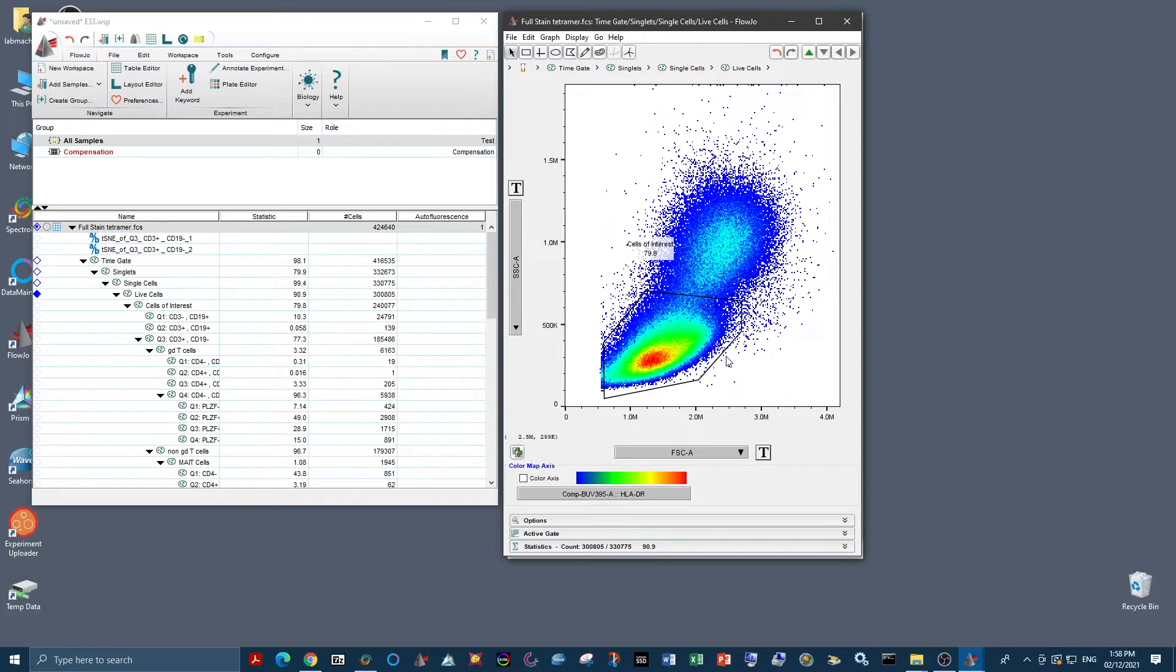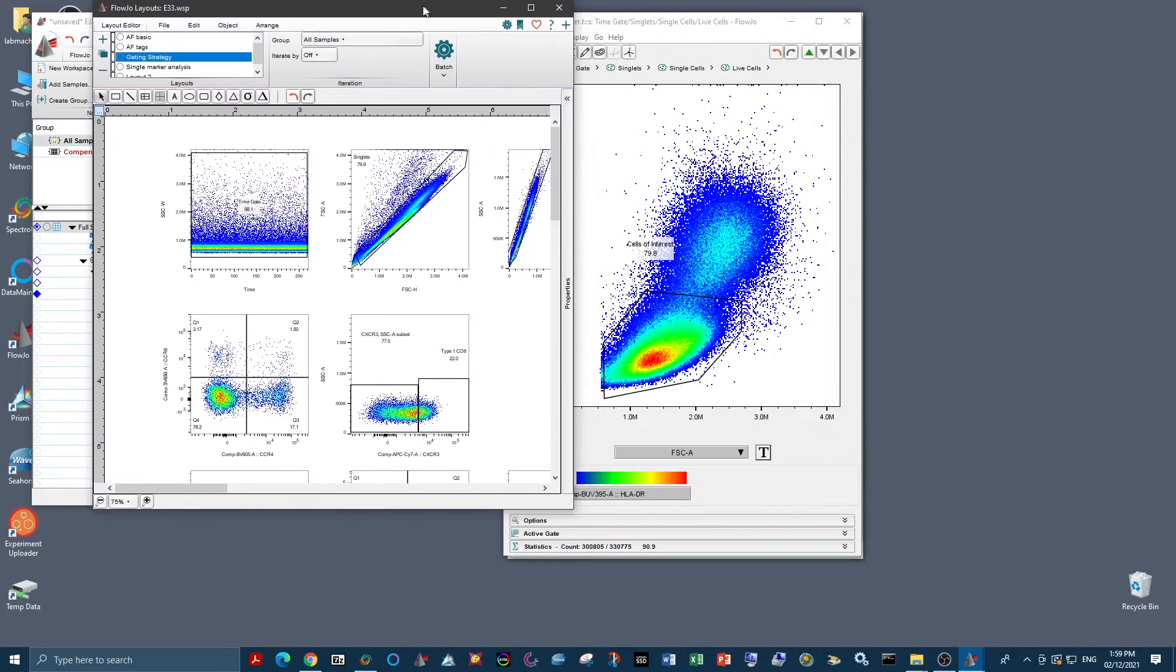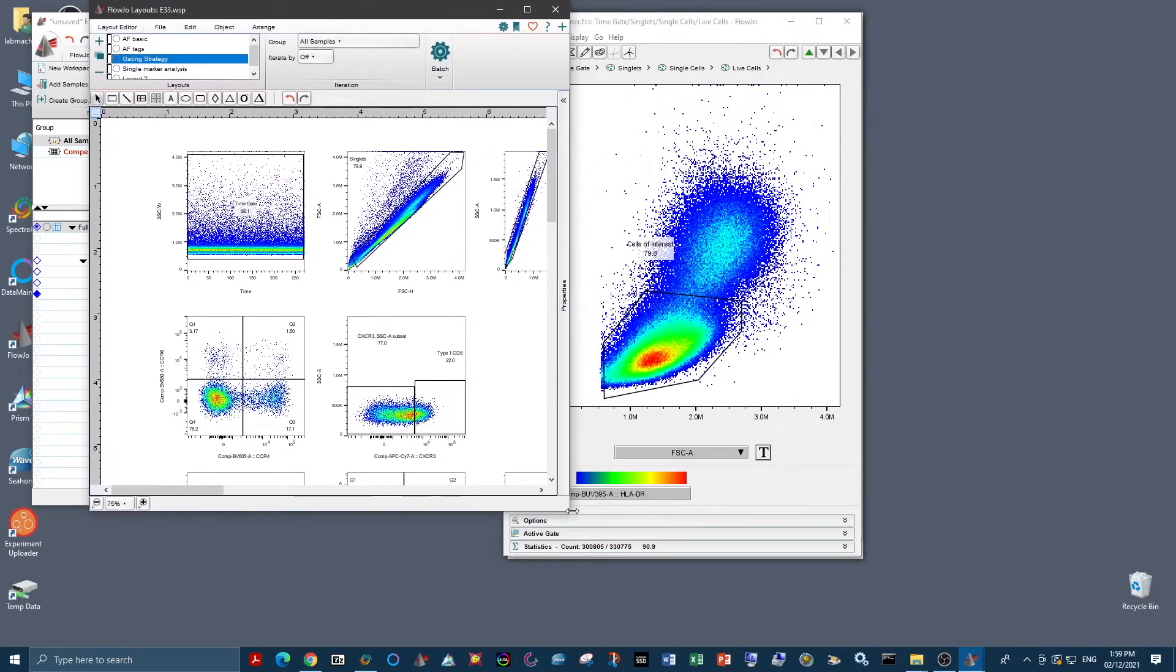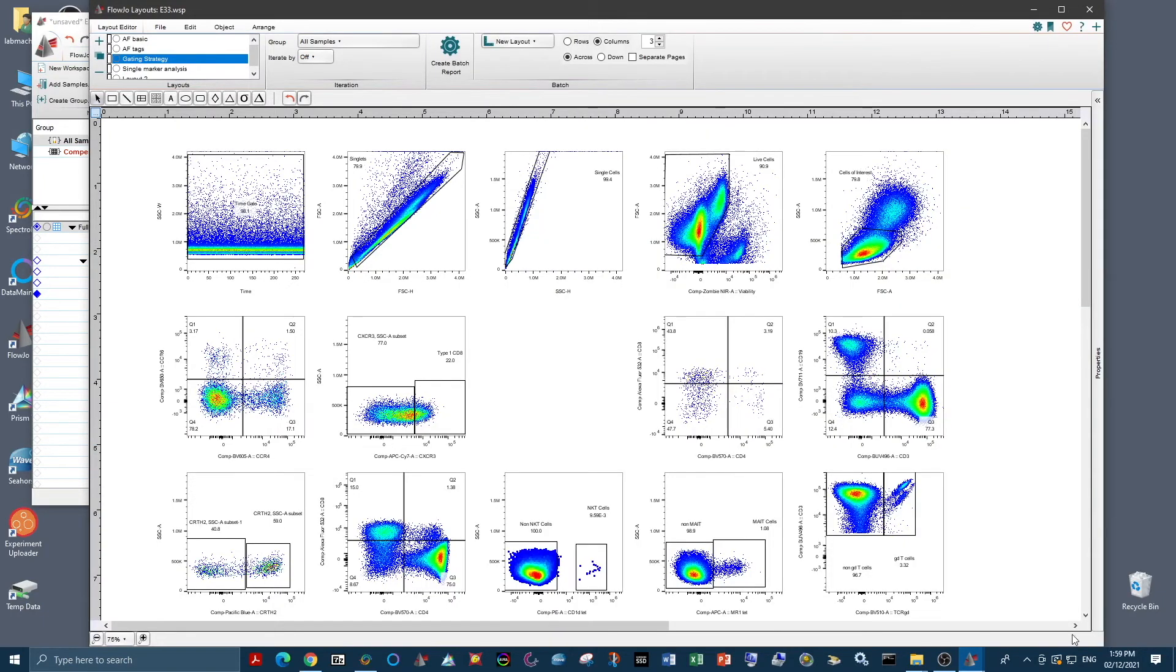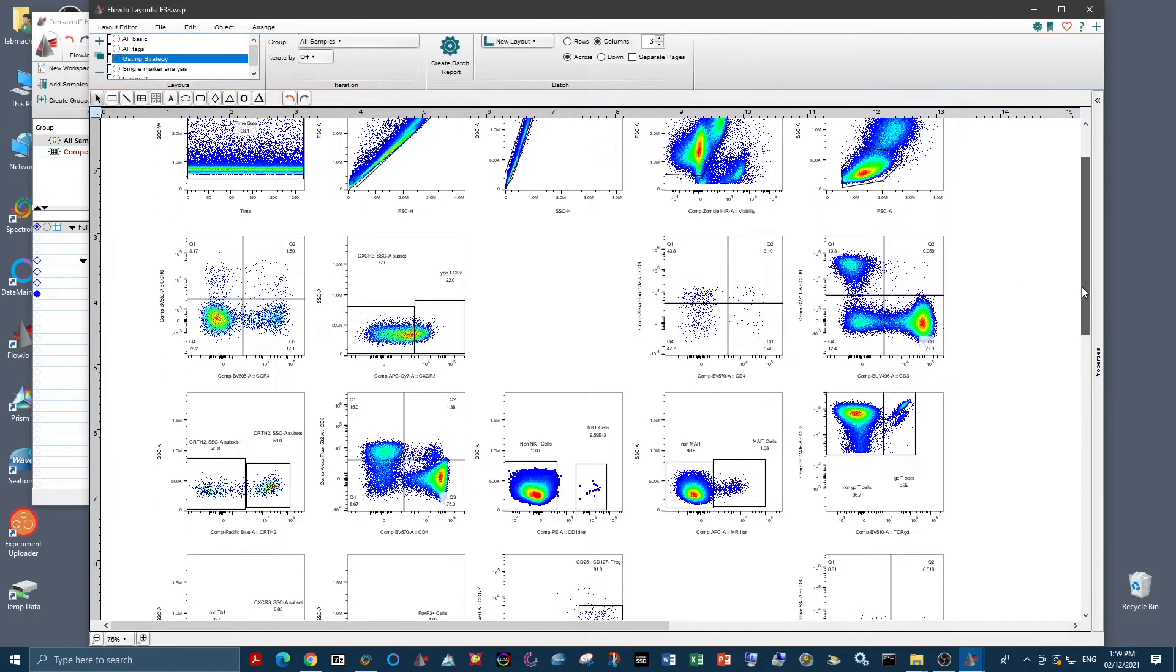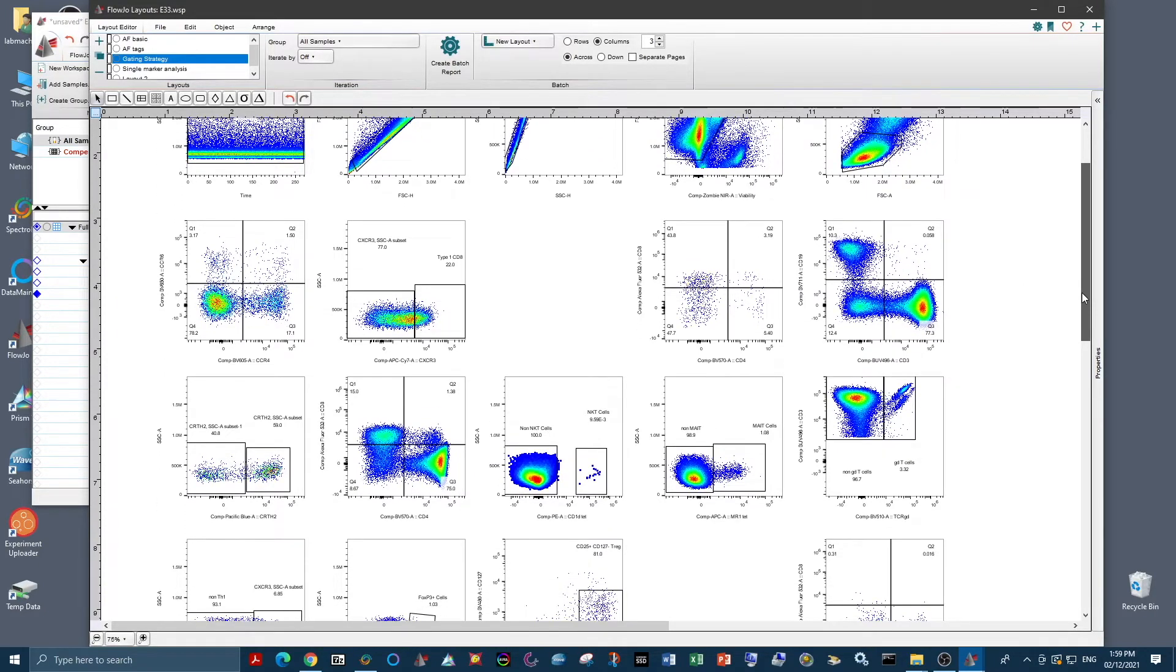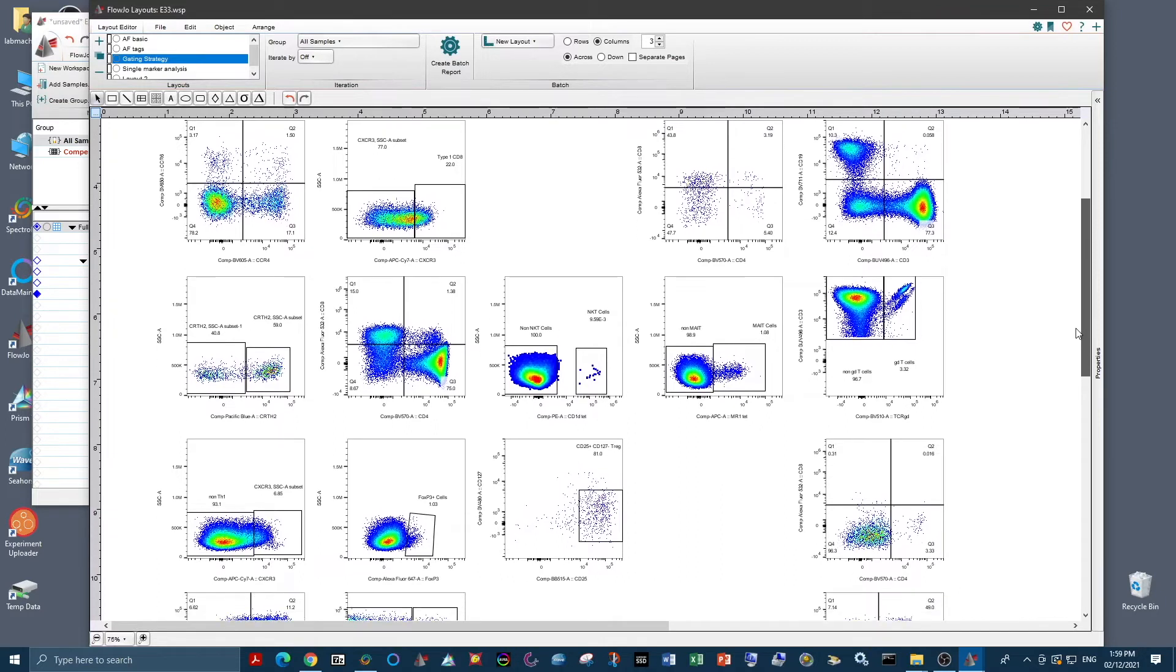Moving down from this, your gating strategy, of course, depends on your panel and your experimental question. But for our gating strategy, this is what we have. And basically you just want to go through and check all the markers that you would expect to see on the cell types that you would expect.